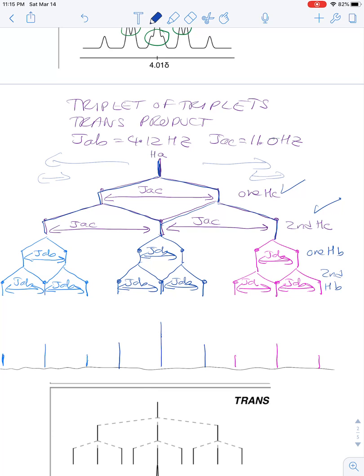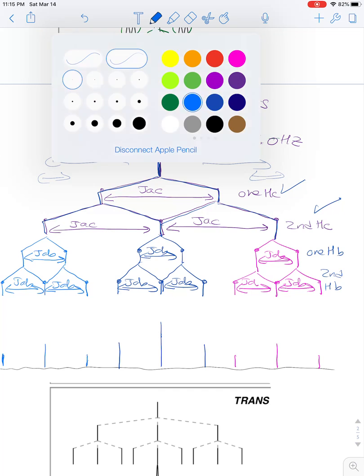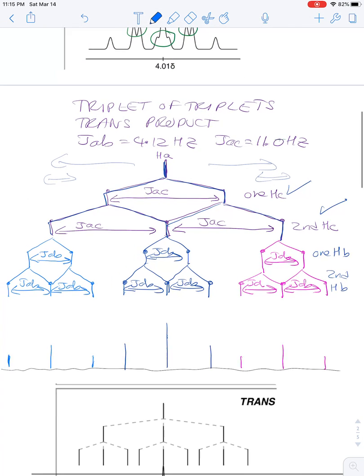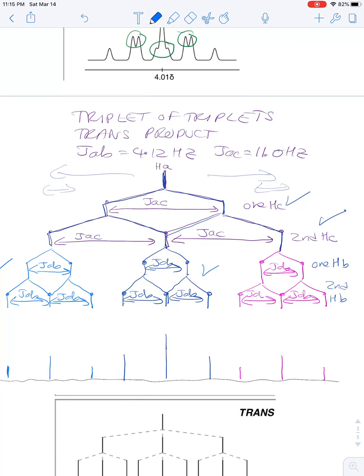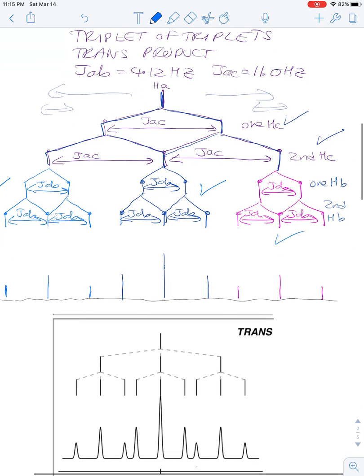Now we're going to take each element of the triplet, and we're going to split it further. These are smaller couplings. So there's the triplet imposed on the triplet for one, for the second one, and for the third one.